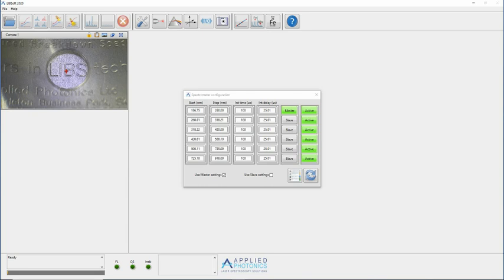This should be set by default, and there is no reason to change this setting unless the hardware in the spectrometer module is reconfigured. Note that if the incorrect channel is set as the master in the spectrometer configuration window, spectrum acquisitions will time out, as the spectrometers will not receive a trigger signal from the laser Q switch.